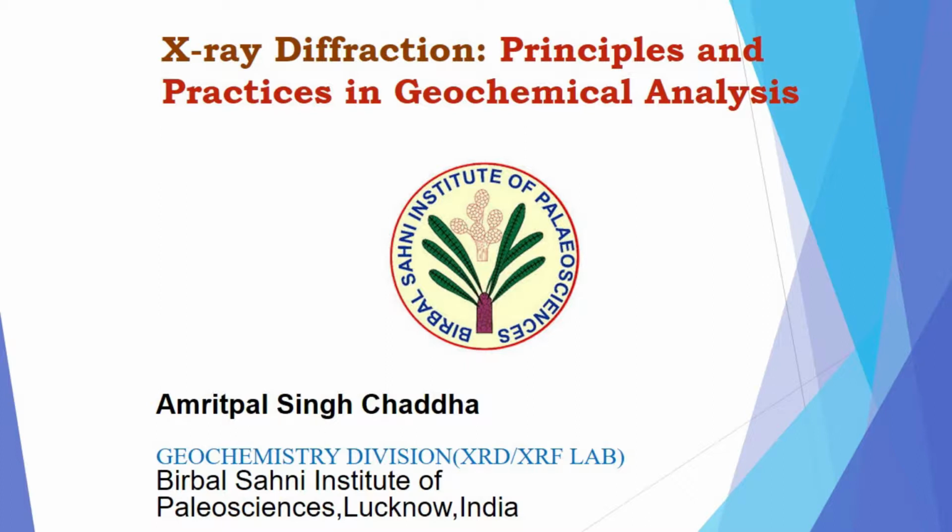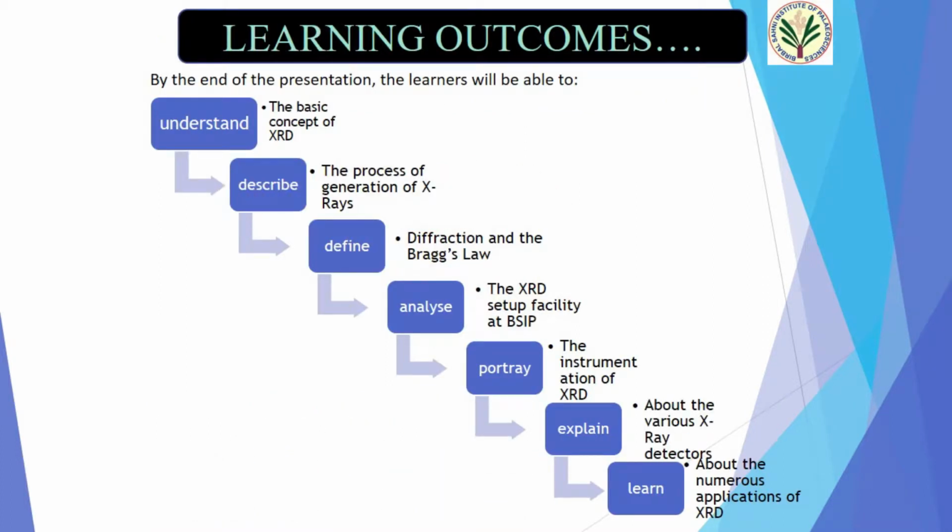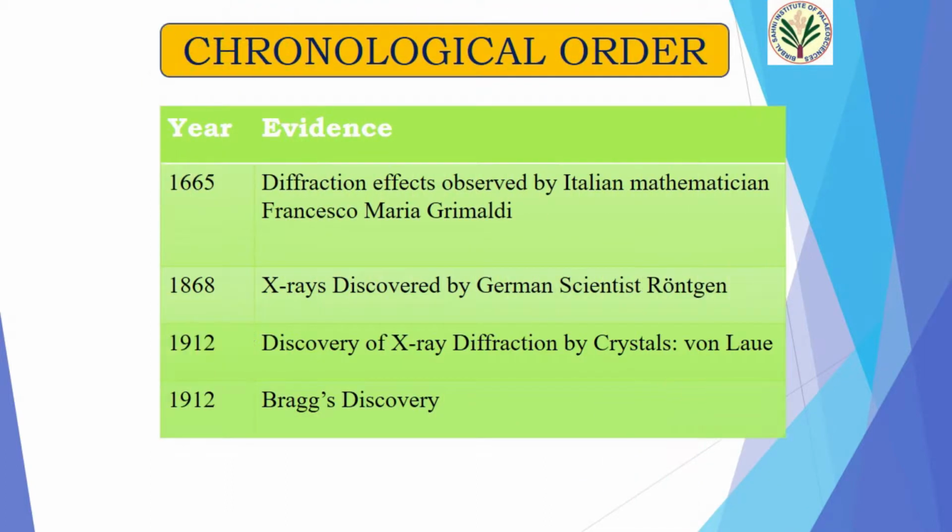Now, after this useful session, the learner will be able to understand the basic concepts of XRD, describe the process of generation of X-rays, define the diffraction and the Bragg's law, analyze the XRD facility at the BSIP, portray the instrumentation of XRD and explain about the various X-ray detectors. And finally, the learner will learn the numerous applications of the X-ray diffraction.